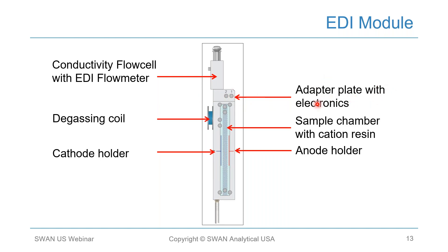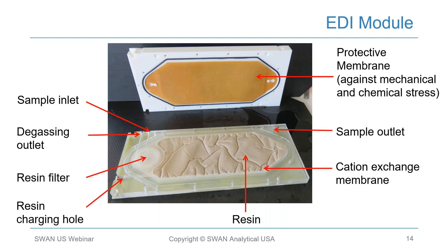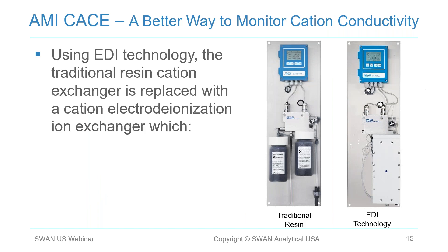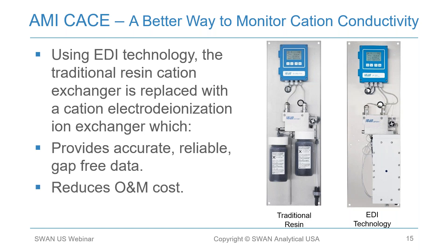Here is the EDI module disassembled. There is a protective membrane to protect the membrane and resin from mechanical and chemical stress. The sample comes in here, there is a degassing outlet port, a resin filter in the membrane module to avoid resin escaping the module, and a resin charging hole. This is the resin contained inside the cation exchange membrane, and the sample exits here. Using EDI technology, the traditional resin cation exchanger is replaced with a cation electrodeionization ion exchanger, which provides accurate, reliable, gap-free data and reduces O&M costs.